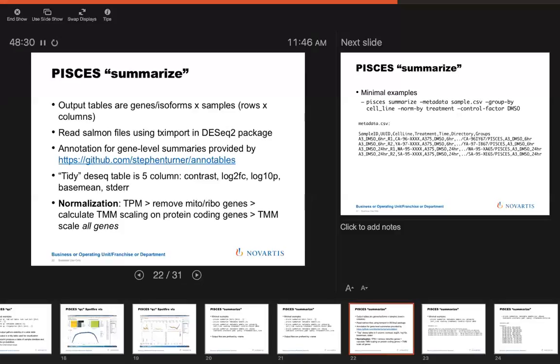Those scaling factors, so you're disquieted that I apply those scaling factors to all genes? Well, you remove them. Are you applying them back to all the ones that were removed? Yes, sorry, that's what I was trying to communicate. Well, how can you make assumptions about the proportion of reads and the transcriptome mass occupied by those that you remove before calculating your scaling factors?